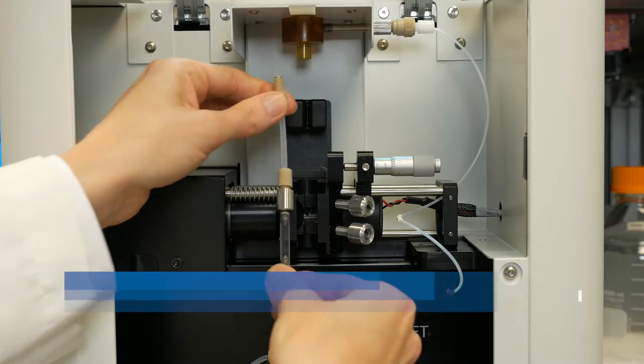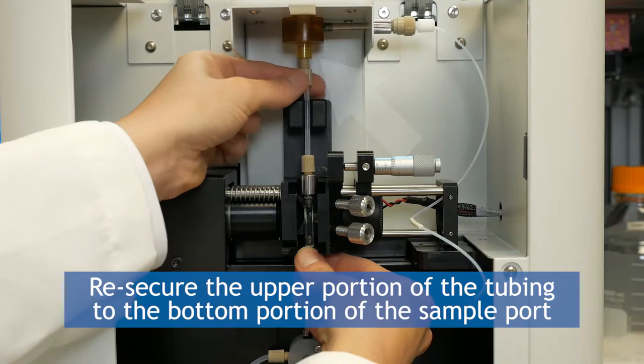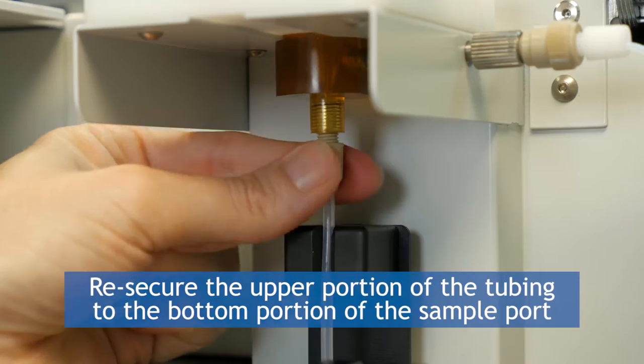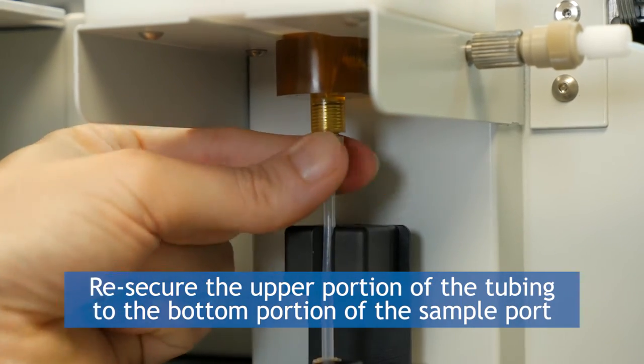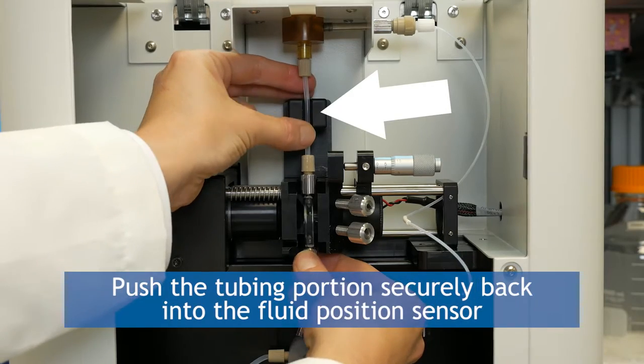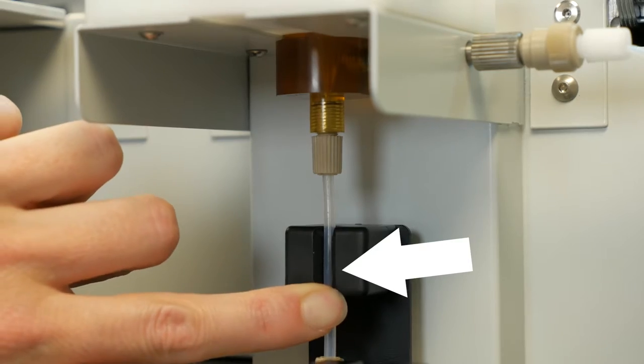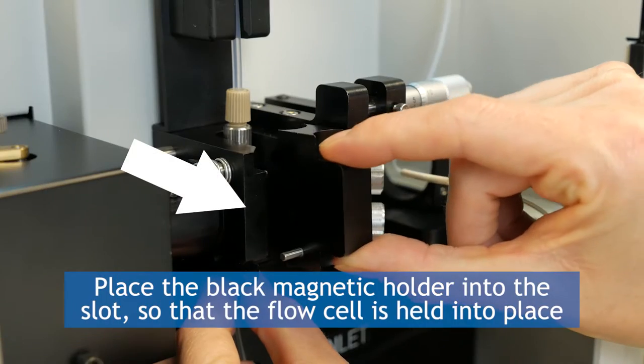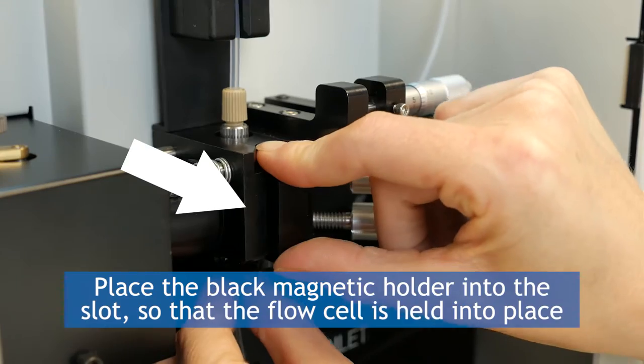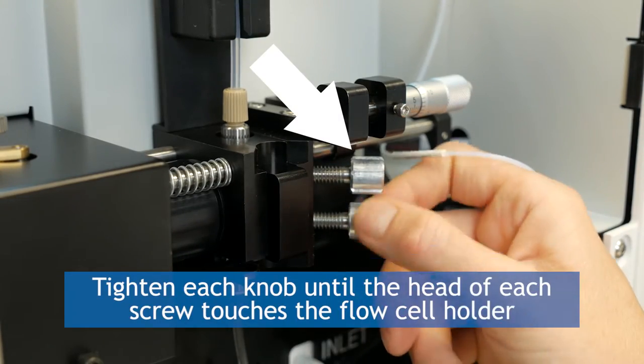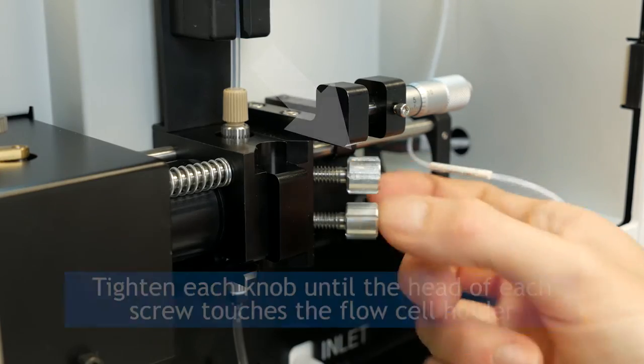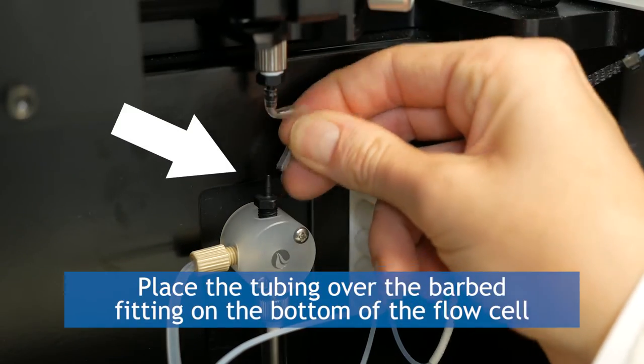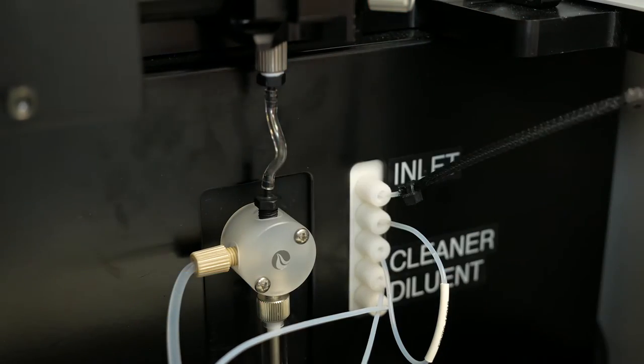The end with the tube fitting should be pointed downward. Re-secure the upper portion of the tubing connected to the top of the flow cell fixture to the bottom portion of the sample port until you hear a click. Push the tubing portion securely back into the fluid position sensor. Next, place the black magnet holder into the slot so that the flow cell is held into place. It is very important to tighten the knobs until the head of each screw touches the flow cell holder. Place the tubing coming from the top of the syringe valve over the barbed fitting on the bottom of the flow cell.